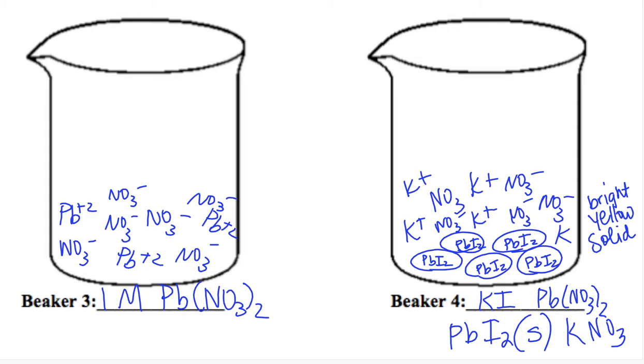Okay? All right, now the last thing I'm going to do is not very exciting, but I need to make a point because it seems like no matter how often I try to knock this concept home, we still get students who just don't understand it. So I'm going to rinse off real quick. This is freaking me out because this is live electrical equipment and I'm just throwing water everywhere. Okay.